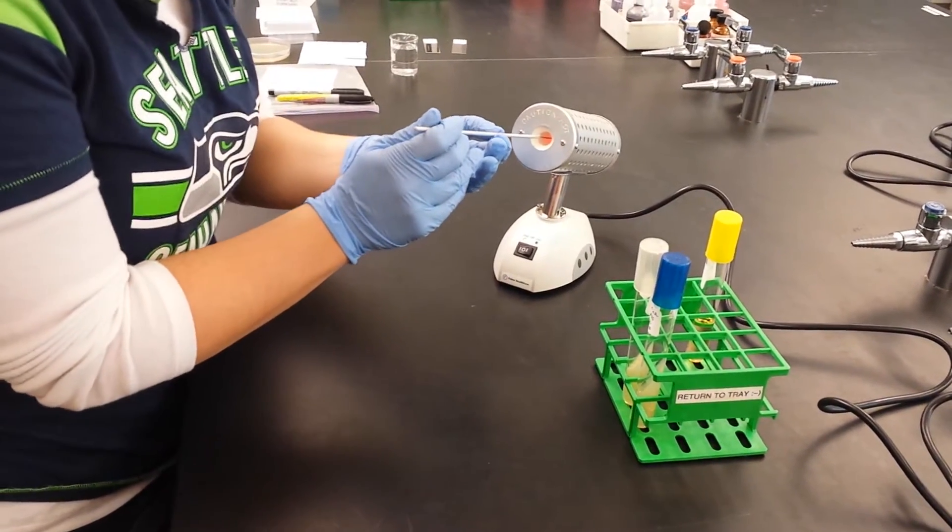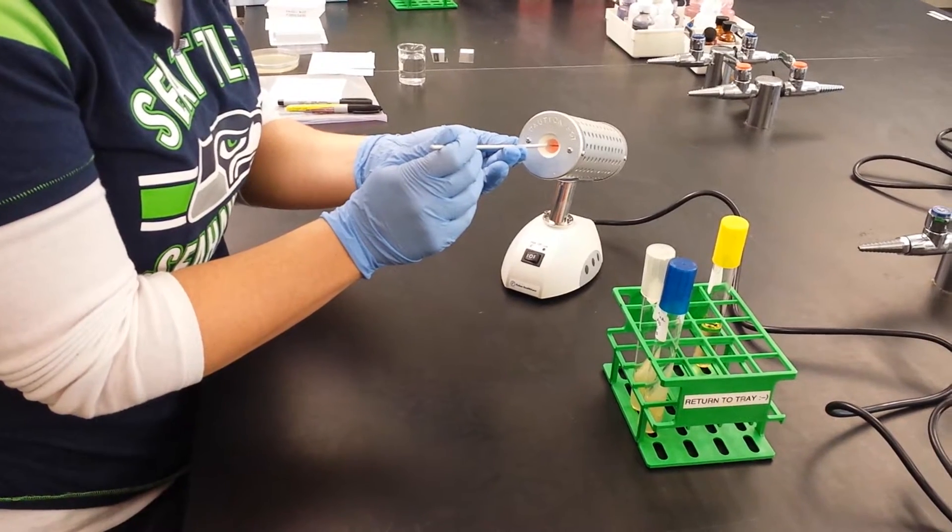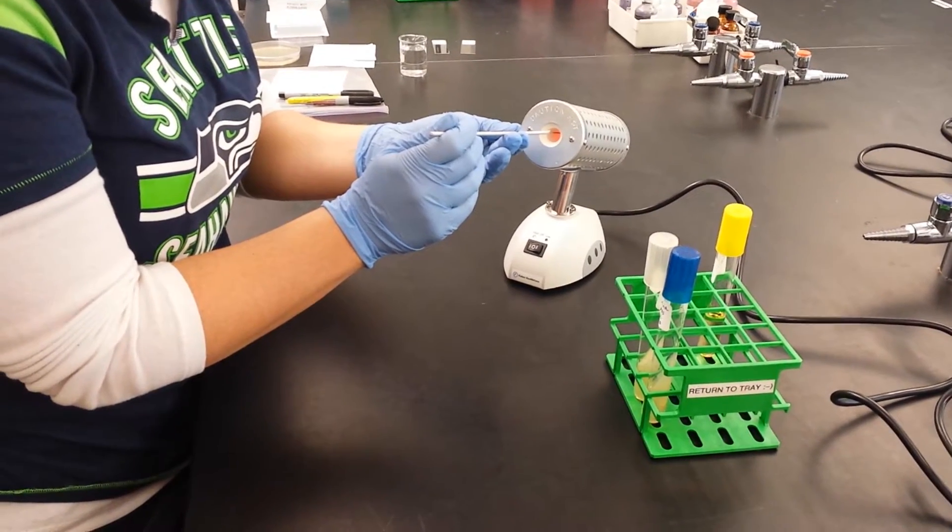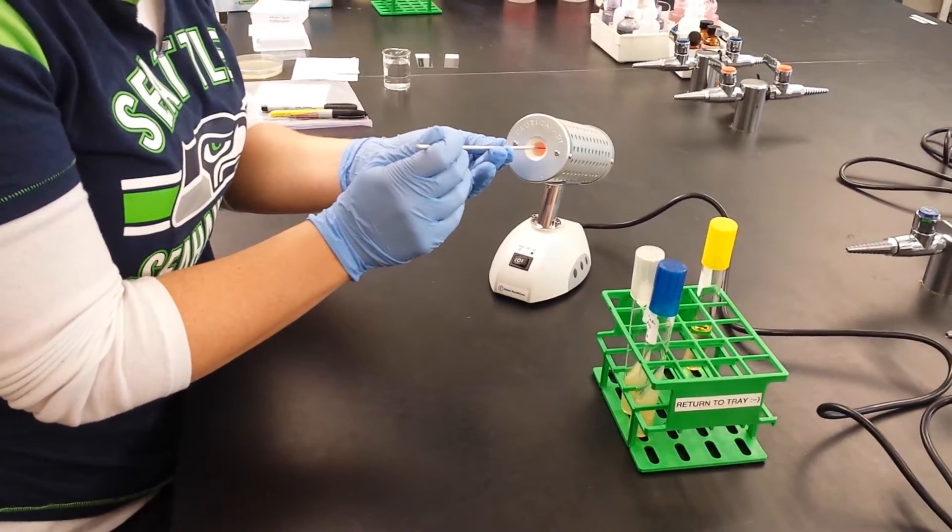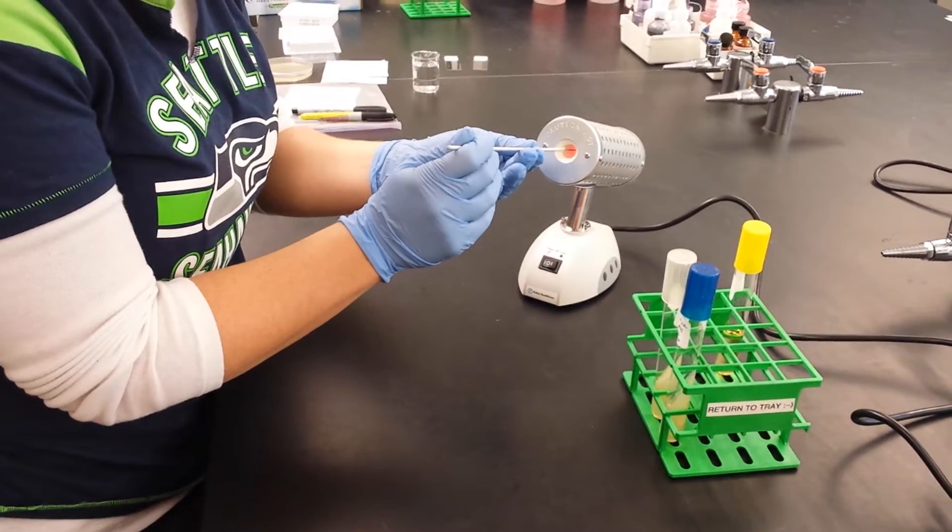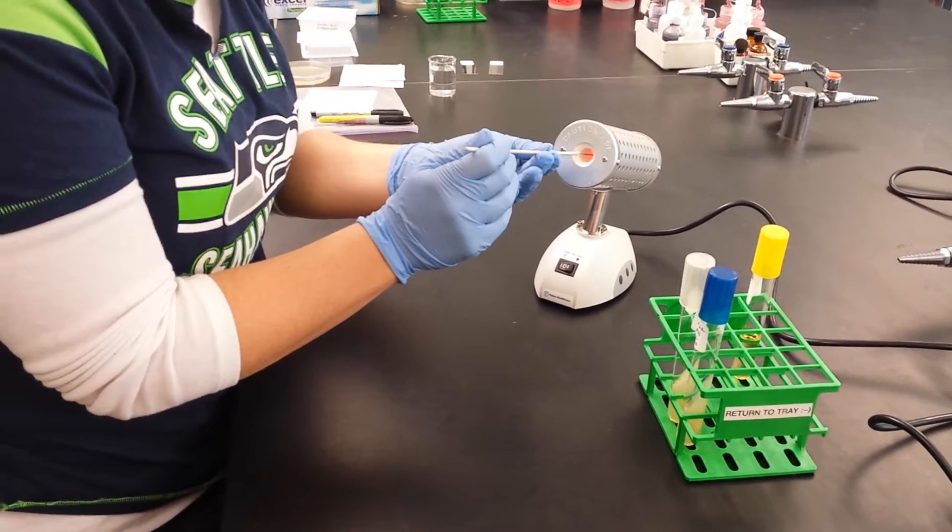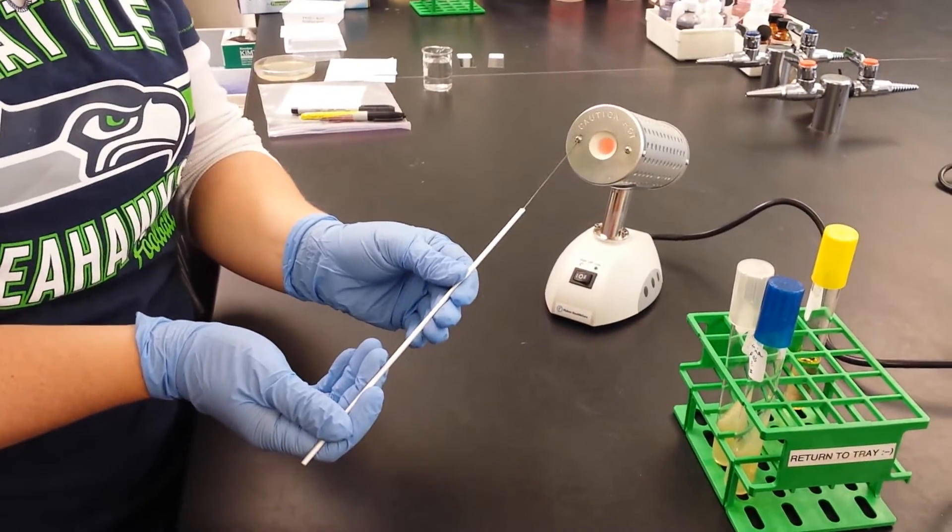is to sterilize your loop in the Bacti loop. So we put it in and count to 10, but slowly. 1001, 1002, 1003, 1004, 1005, 1006, 1007, 1008, 1009, 1010. And that should be long enough to make it red hot and glowing, although the glow goes away right away. Now it's sterile.